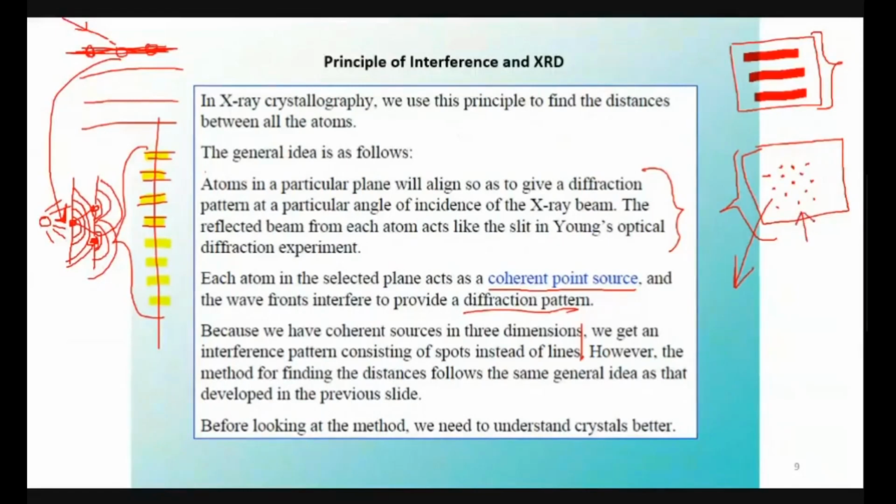Now, you don't have to go into that detail of how that mathematics is applied and how the pattern is produced. Just remember this much: some mathematical calculations are applied by measuring the distances between dots. These distances between dots are measured, the pattern is studied, and for different patterns there are different formulas. There are only a certain number of patterns that are available.